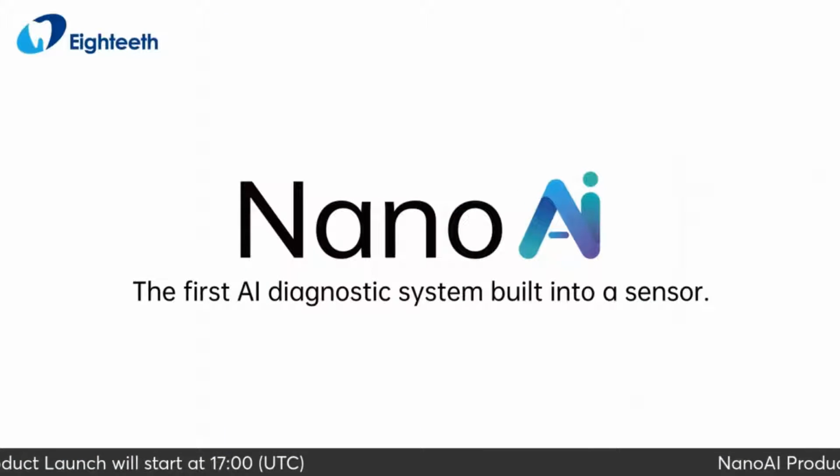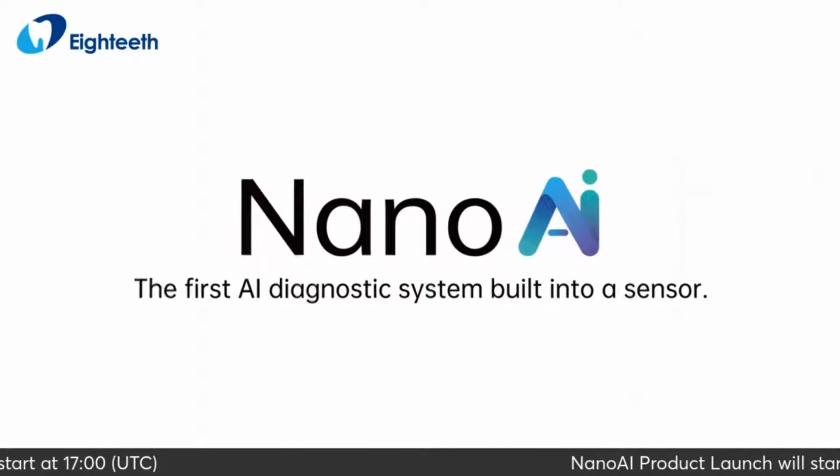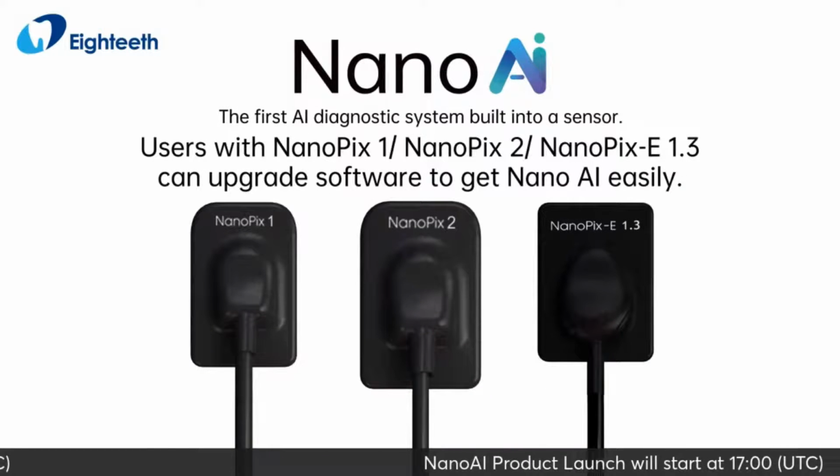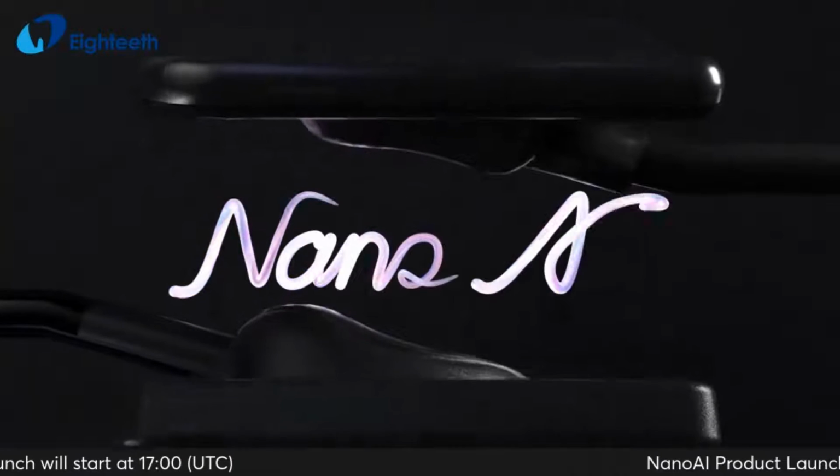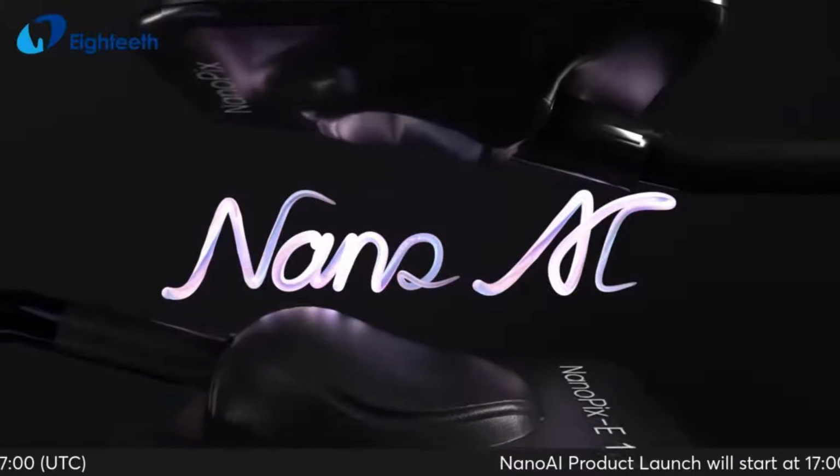NanoAI, the first AI diagnostic system built into a sensor. Users with NanoPix 1, NanoPix 2, NanoPix E can upgrade software to get NanoAI easily. So today, with NanoAI, we take NanoPix to the next level.